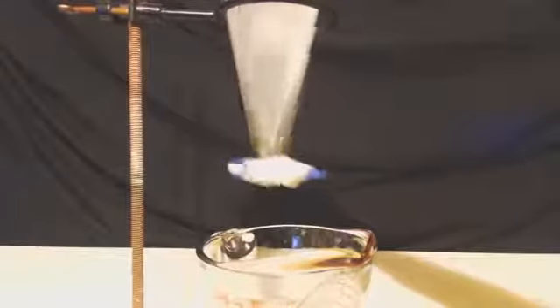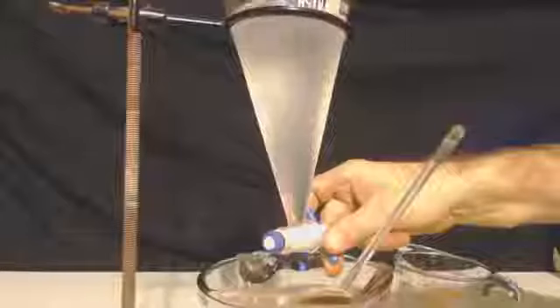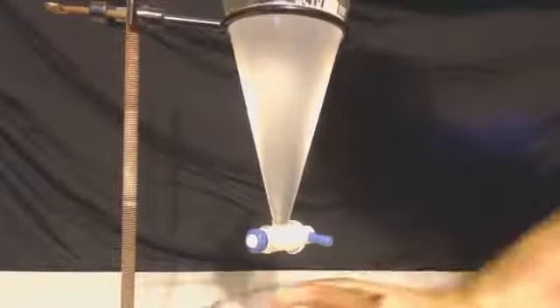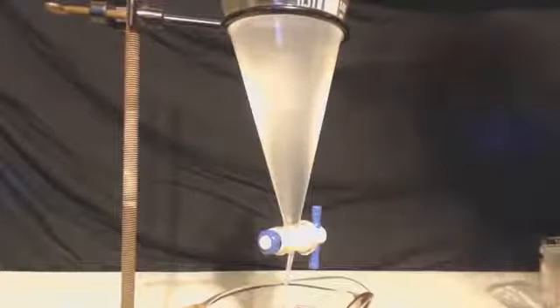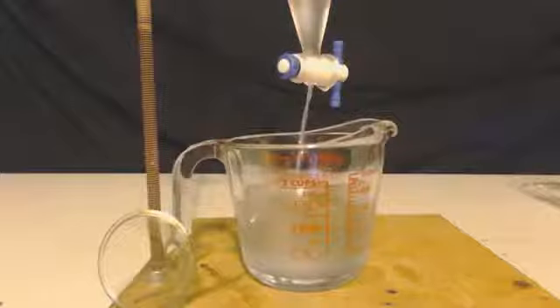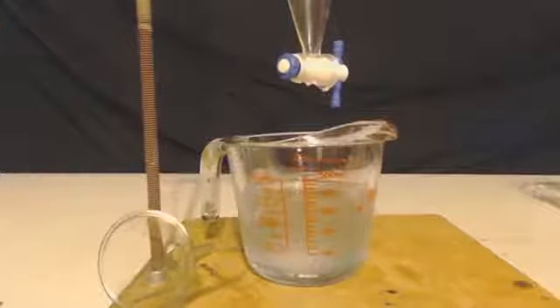Shake it up. Let it settle out. And I'll drain the bottom layer out. Now all I have is the non-polar stuff on top there. I'm going to drain that out into a container and see how much we got here. Keep in mind we started with 450 milliliters. We're going to end up with about 345 here. So we got rid of 100 milliliters of alcohol and acetone and whatever else was in there that was polar.